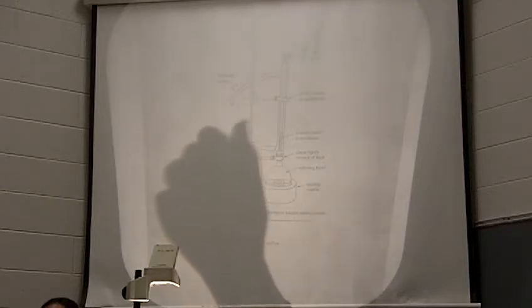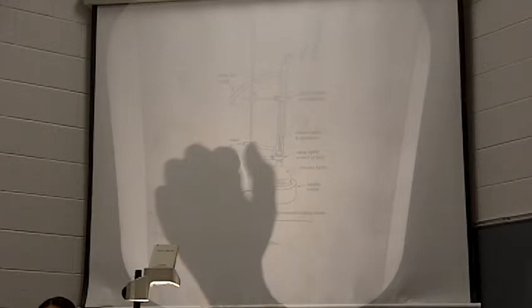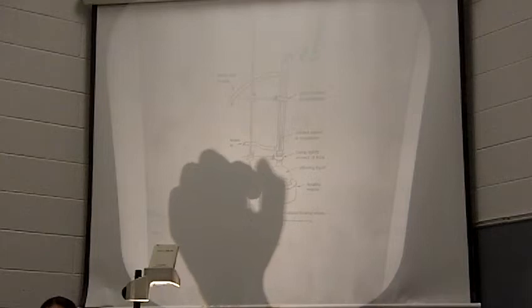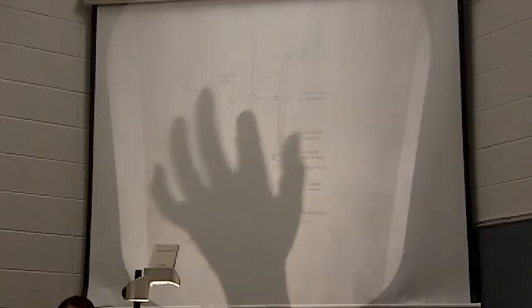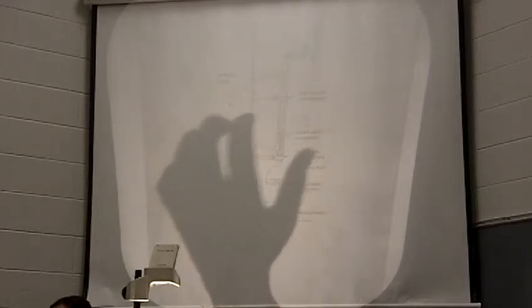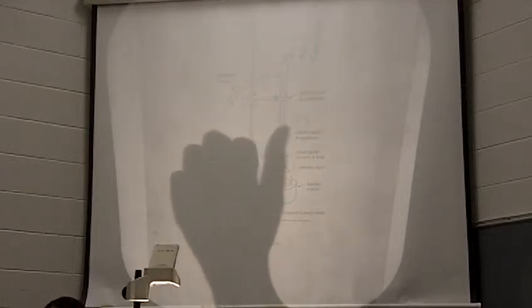And that is how we will control the temperature going to the heating mantle. The numbers on the dial correlate to how much voltage we're giving the heating mantle. We're not going to give it 100% voltage because then it would be too much. It'll get too hot, all right? So we control the heating with that dial. We'll probably start our heating at about 60 to 70, and then we'll want to keep an eye on what's going on in our reaction and adjust it as we need to, okay? If it gets boiling too vigorously, we'll slow it down. If it's barely simmering, then we'll crank it up a little bit, all right?